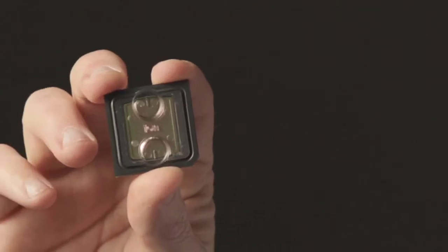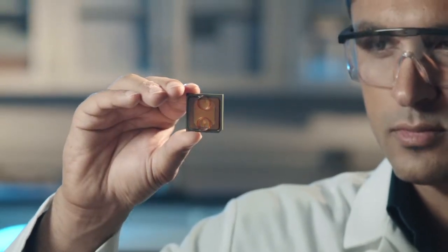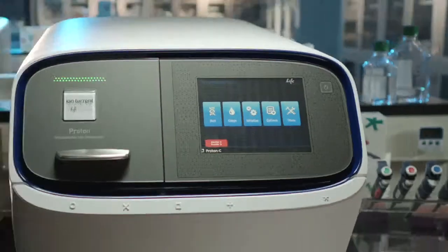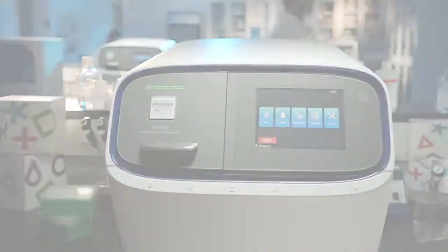Every teenager who has a smartphone or camera phone has a little CMOS chip, and that chip has thousands of pixels that measure the intensity of light coming in to generate a photo. But instead of a sensor for light, it's a sensor for chemistry. And it's really this first sort of crossing the divide of chemical to digital information.